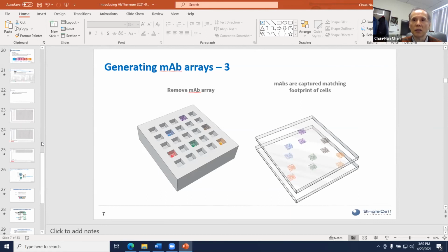And if we recover 70% of those sequences, then we get 700 sequences. And it's more than enough for any group looking at that. In fact, they sometimes complain we have too many sequences.